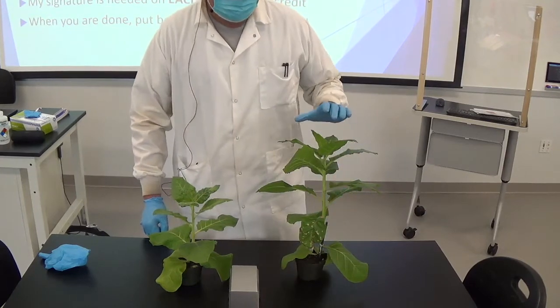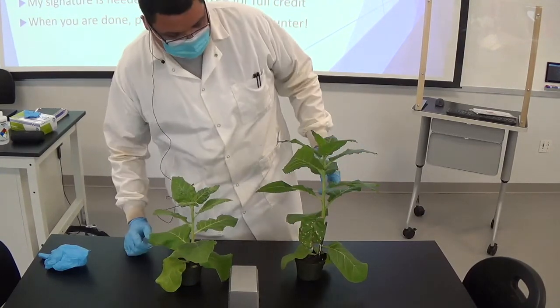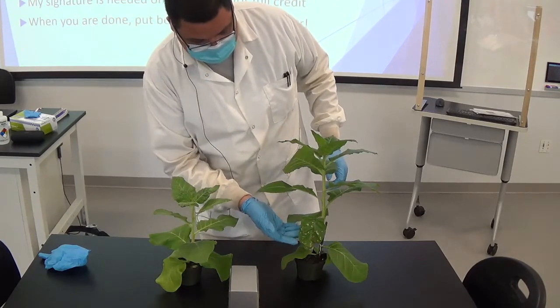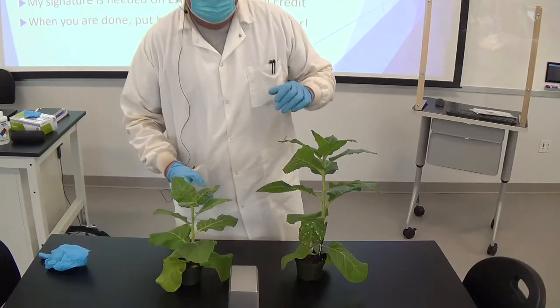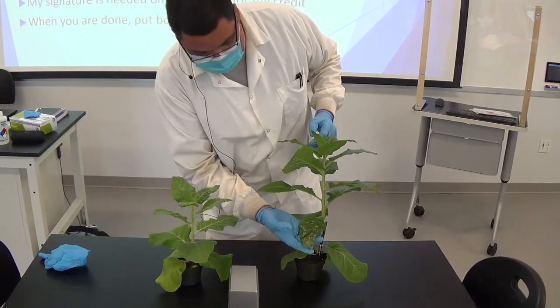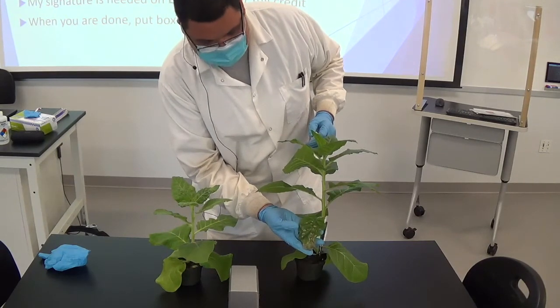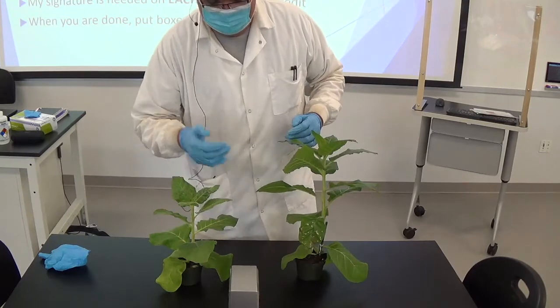Alright, so here we have the two tobacco plants that we inoculated, I think it was a week ago. We rub inoculated the plants, so we've got our resistant variety and we've got our susceptible variety that we inoculated with TMV. Looking over here at the resistant variety, it looks kind of like it's not doing too well, this leaf over here, compared to this plant, which is true.